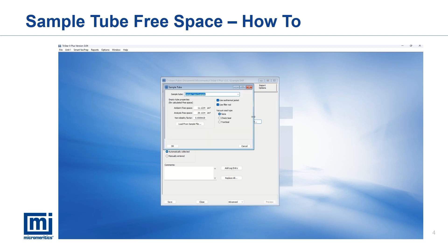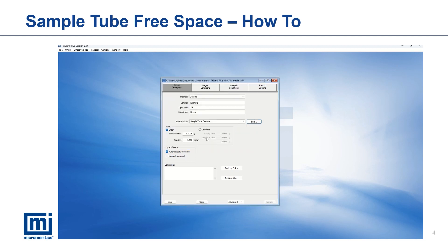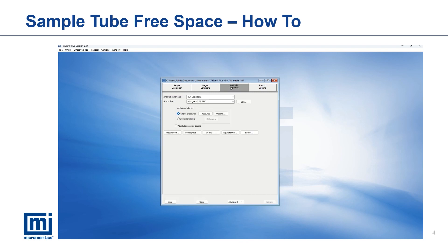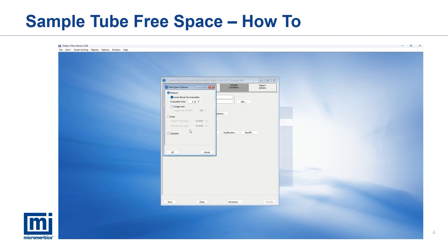To determine the sample volume, it is important to enter an accurate sample mass and the material's skeletal density, which can be obtained from literature or measured by gas pycnometry. Next, navigate to the analysis conditions tab, click free space, then select the calculate option.